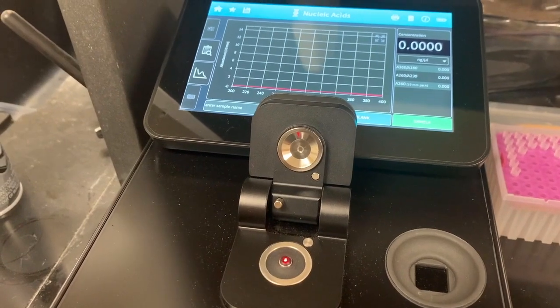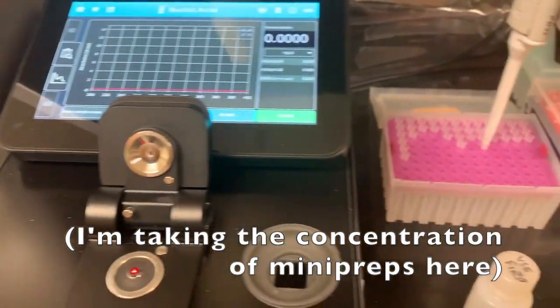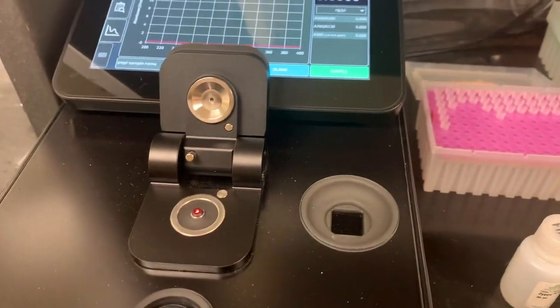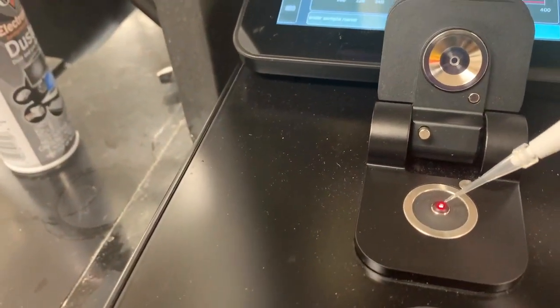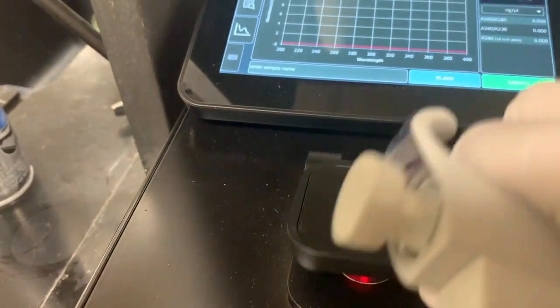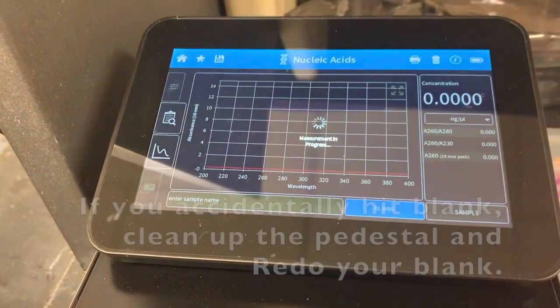So now I'm going to take my first sample. You'll use regular tips for DNA or the RNase-free tips for RNA. And I'm just going to pipette that sample out. And then again, pipette directly onto the pedestal. Okay. You're going to close that again, and this time instead of hitting blank, you're going to hit sample.